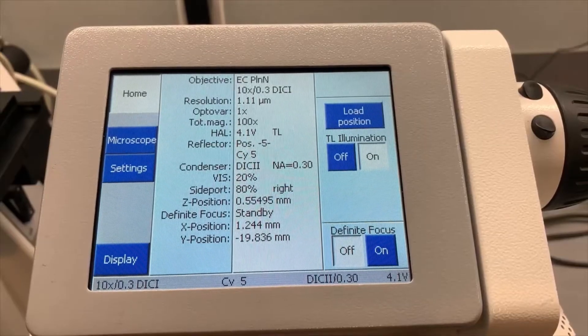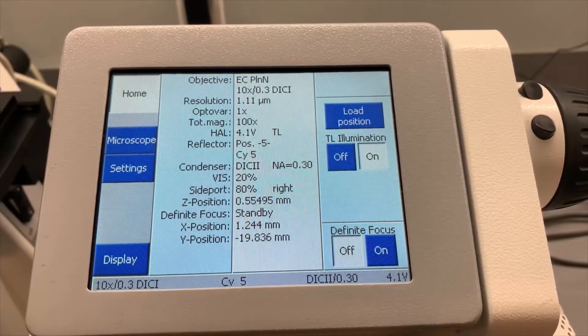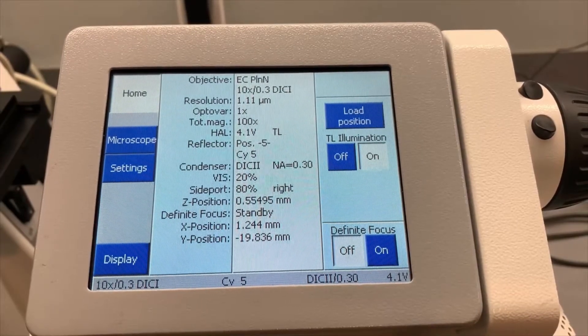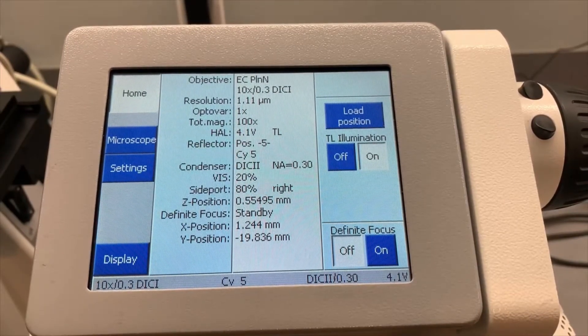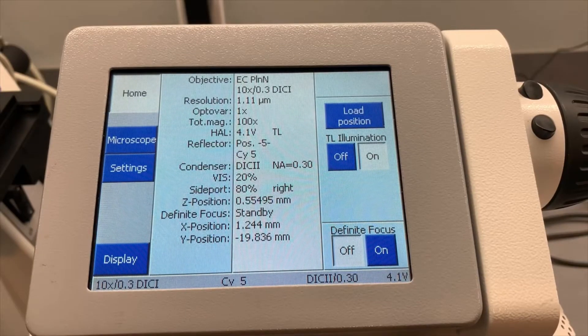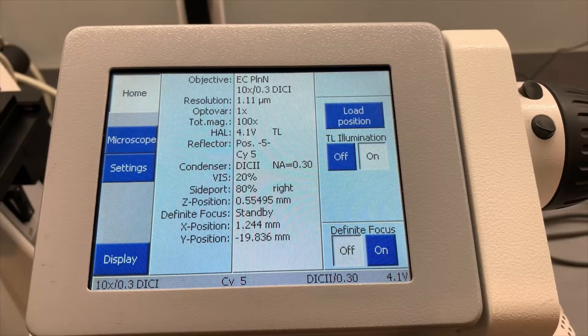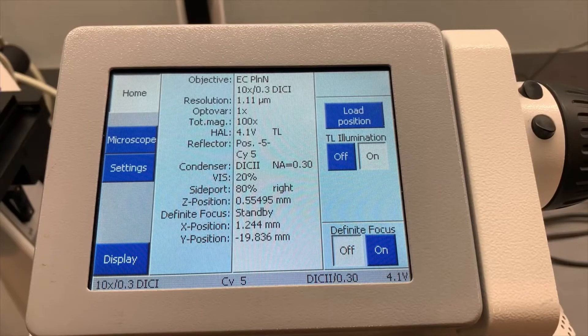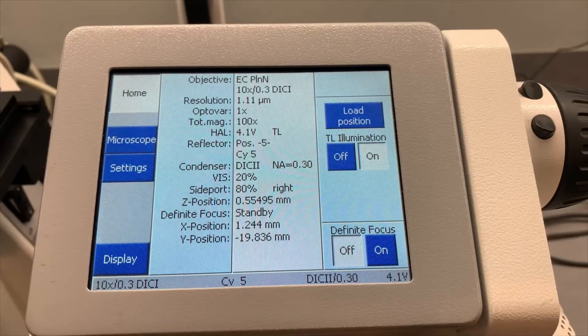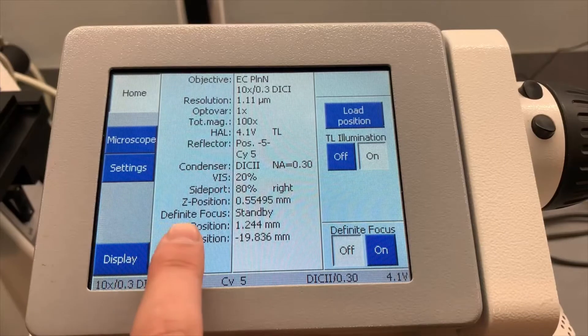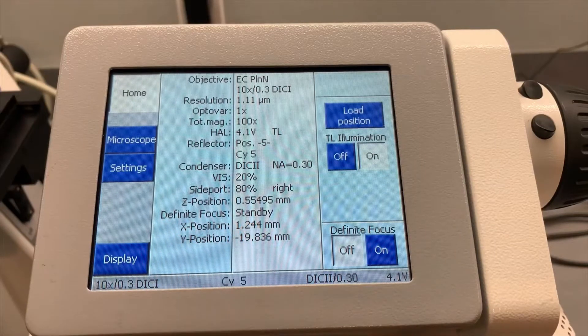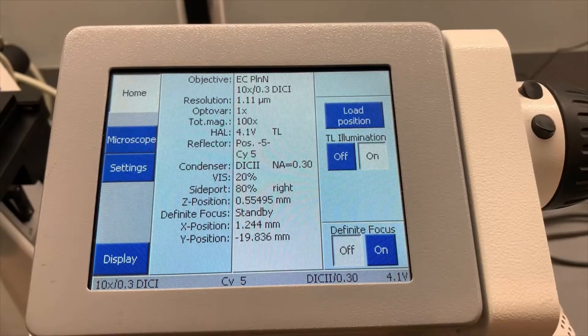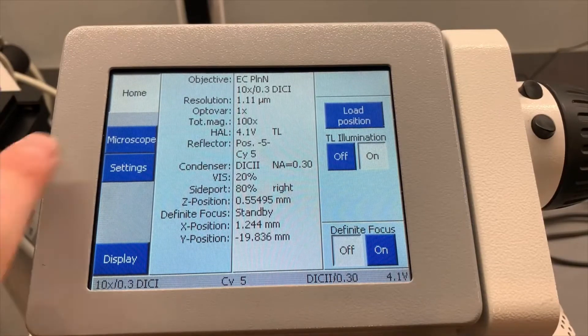As Brian was mentioning earlier this is the Zeiss Observer Z1 with the Definite Focus module attached. So here's the main dashboard display. This main screen just gives you a synopsis of everything that you have programmed and where you're at with this microscope as it's standing. As you can see right here this is definite focus standby which means the focus is working and is on and it's actively reading the position.